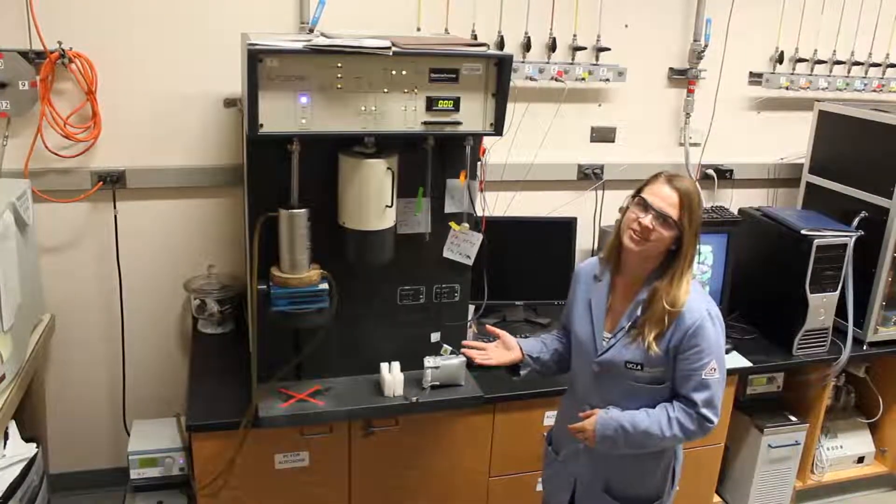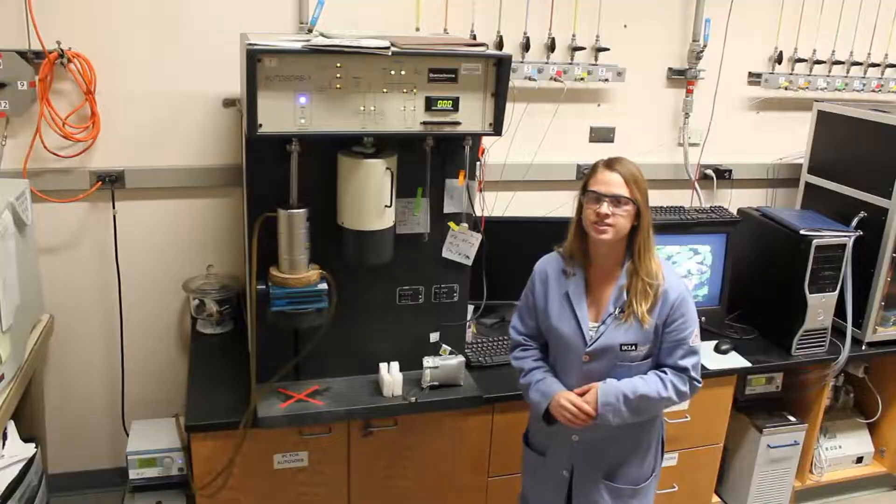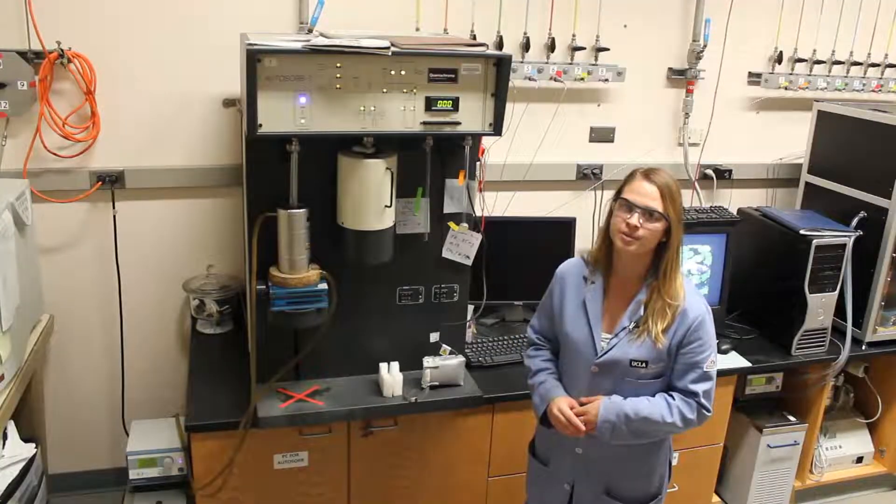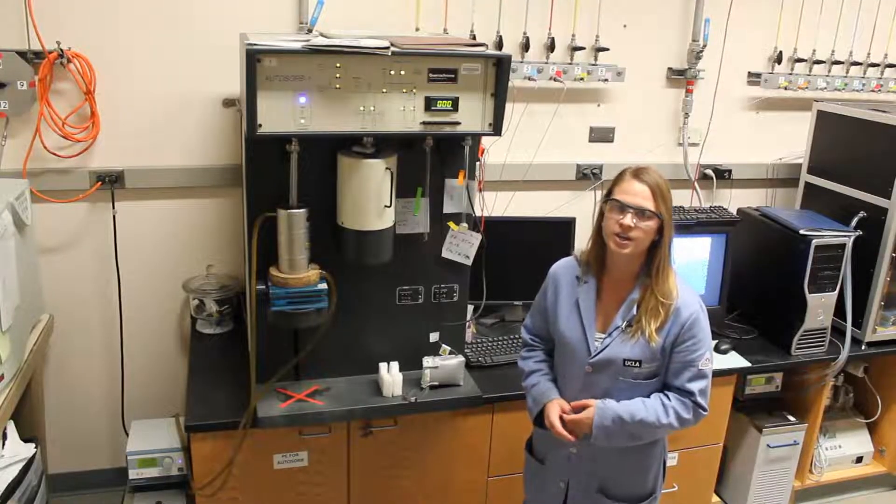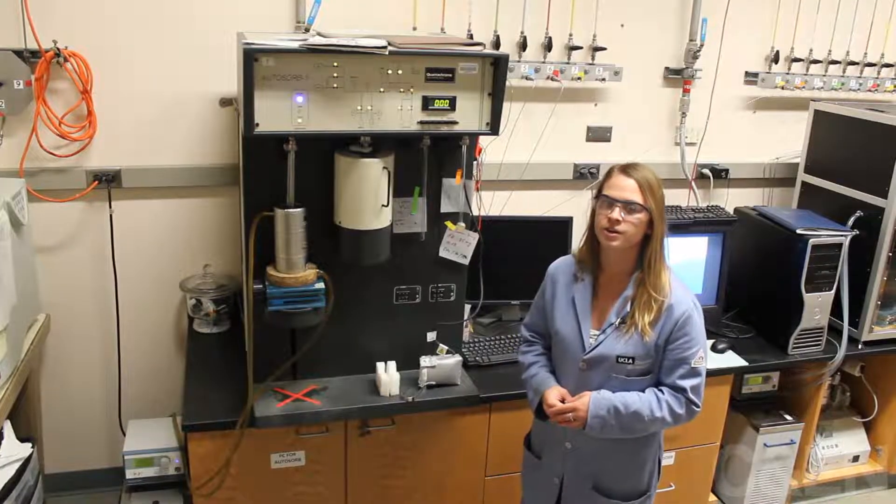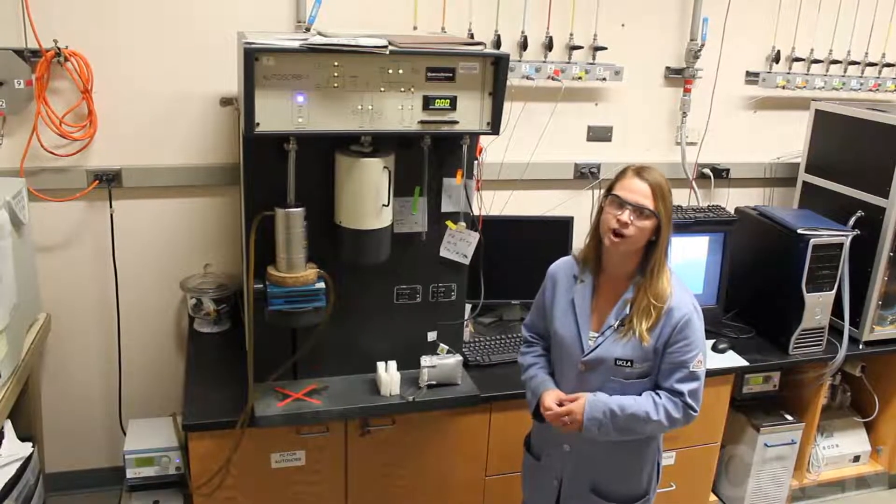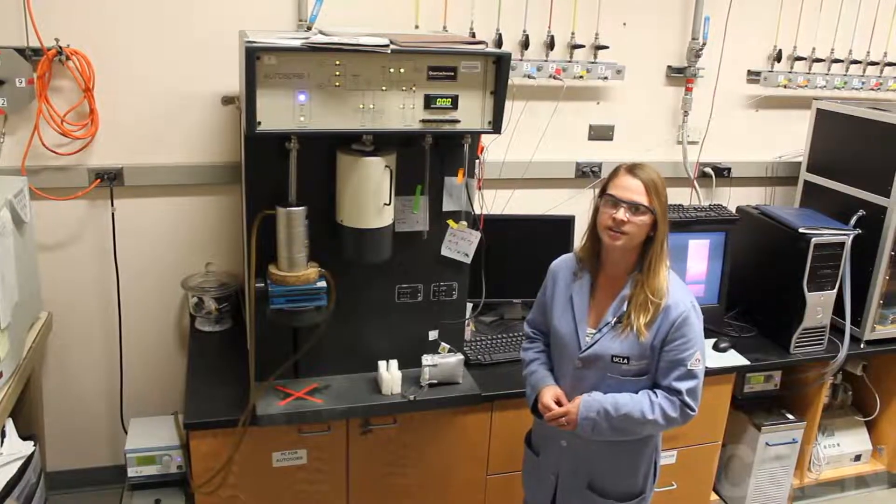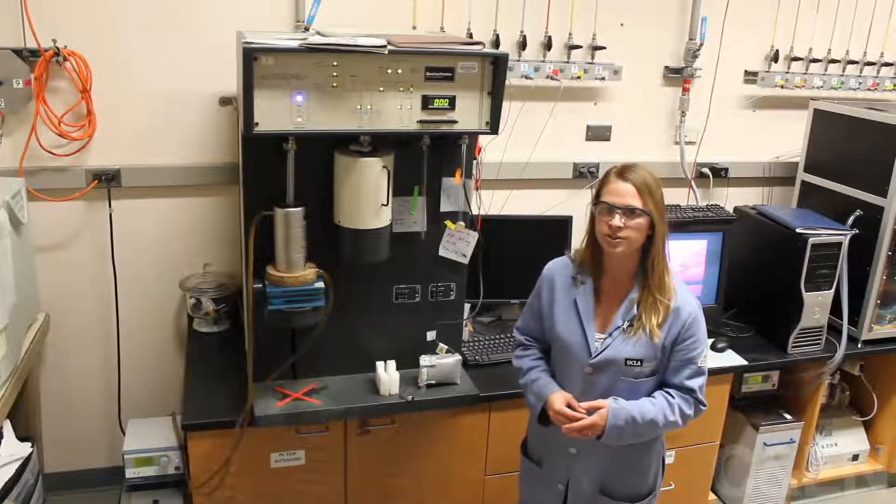The instrument behind me here is an autosorb. This instrument gives us insight into the surface area and porosity of our materials. It also gives us information about the capabilities of our materials for gas absorption for carbon dioxide, methane, hydrogen, and other gases such as nitrogen and argon.